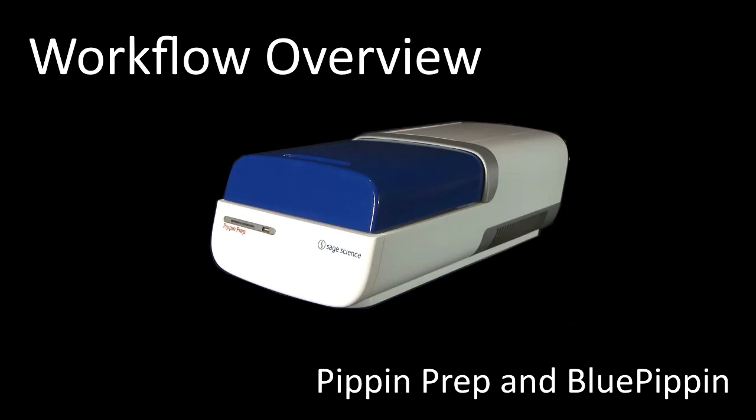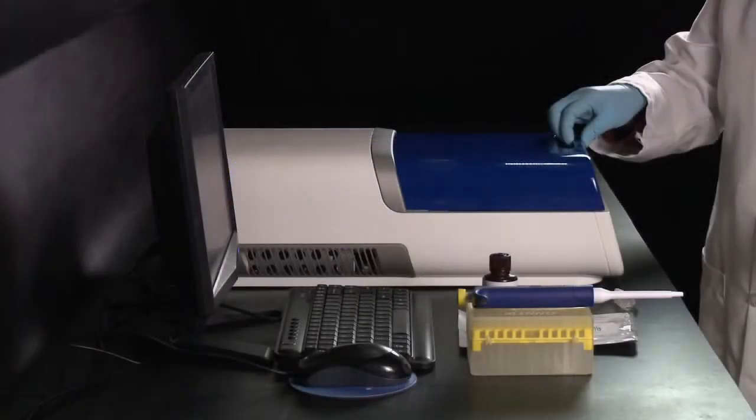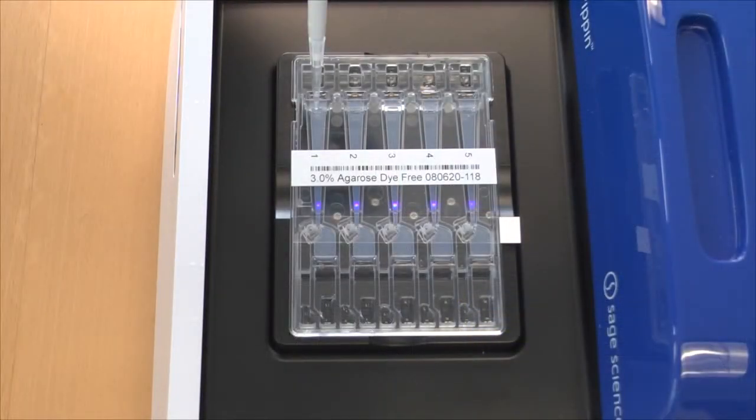This is an overview of the workflow for using the Pippin Prep and Blue Pippin systems. Detailed instructions for these steps outlined here are presented in subsequent tutorial videos.